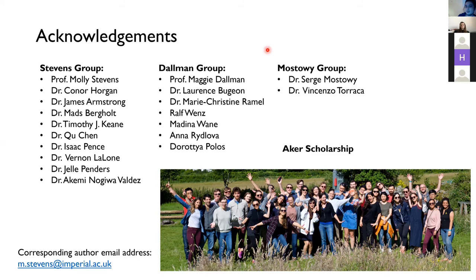And referring to my answer to James, where I said you need a very clear hypothesis: obviously, if you can identify bacteria with fluorescence and then specifically image those areas, that would speed up your imaging and refine the analysis a lot. So I think that's a super interesting thing, and it should be possible. It's not something we tried. So with regards to that, can you speak a little bit more about the resolution of the imaging, or if you wanted to focus on a particular bacteria, is that possible using this technique?